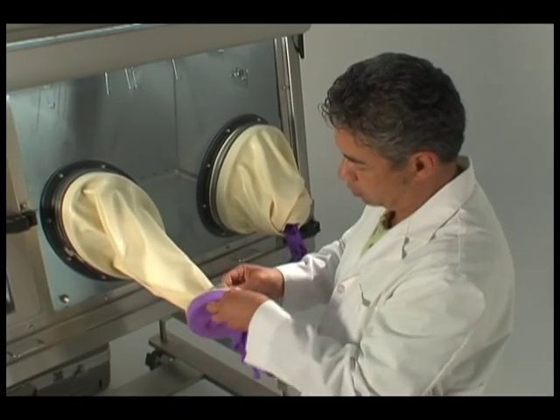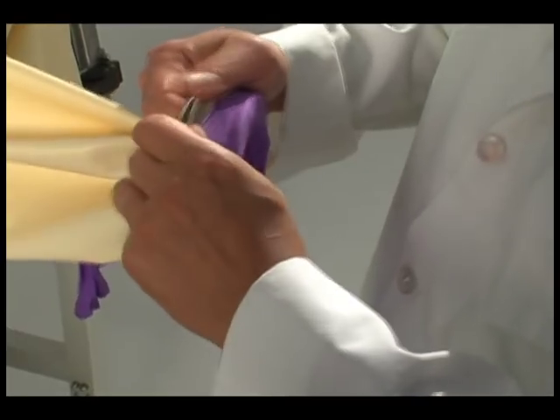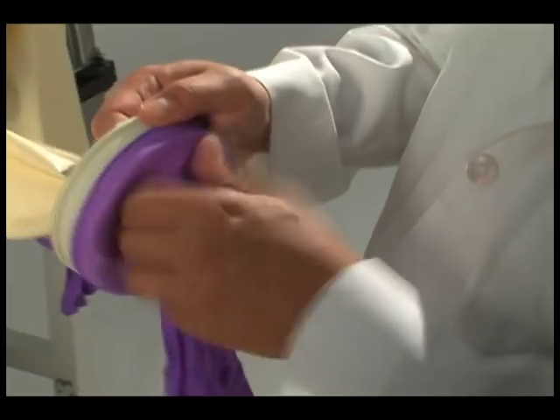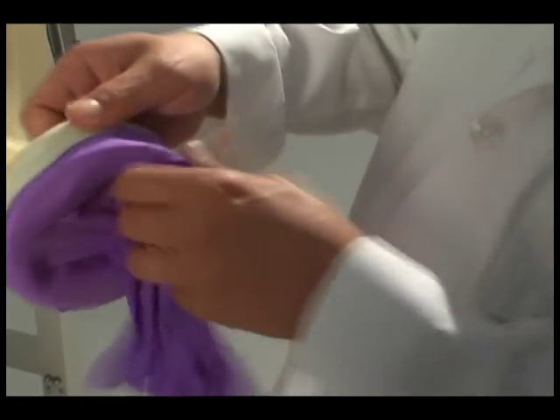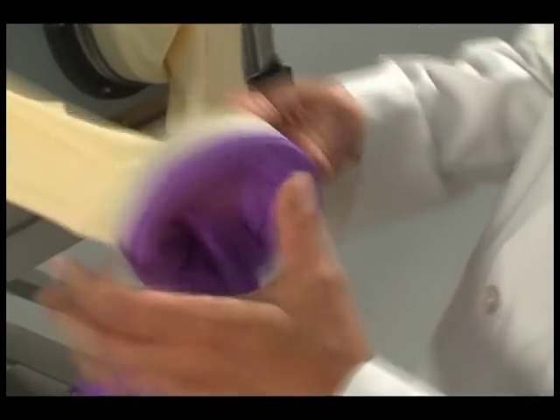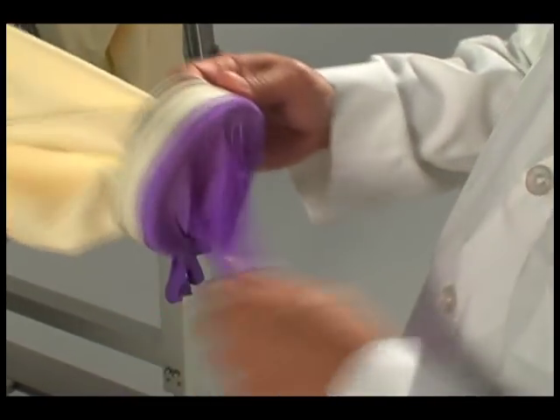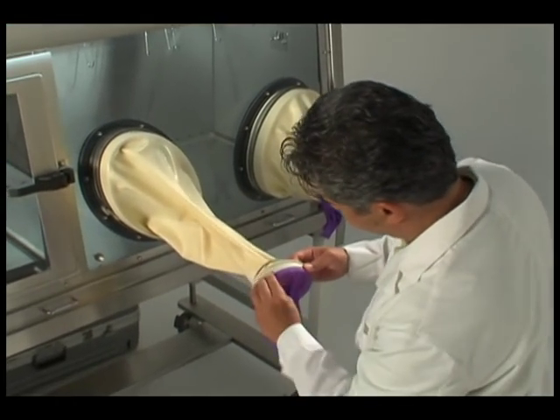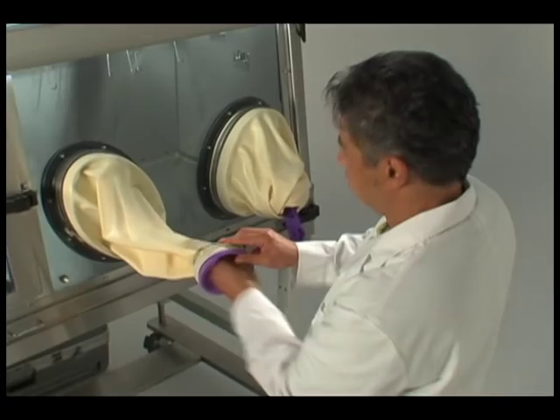Carefully pull the glove forward into the first groove. Do not pull the glove off of the glove sleeve ring, as this may expose you to any hazardous material still present in the interior environment. Push the glove into the ring area.